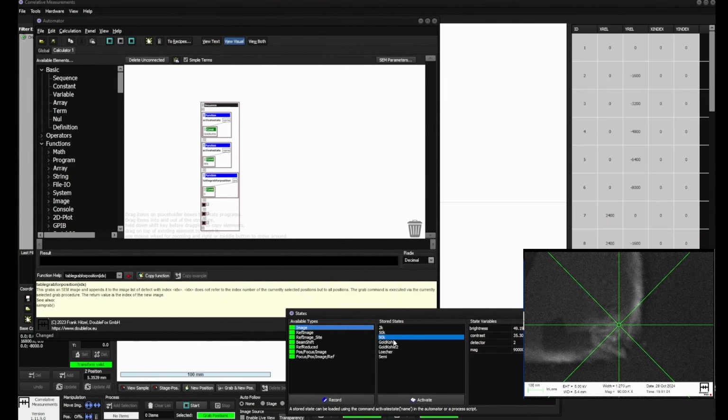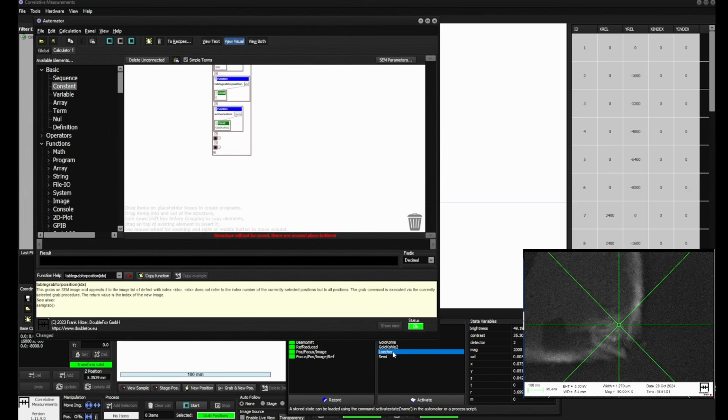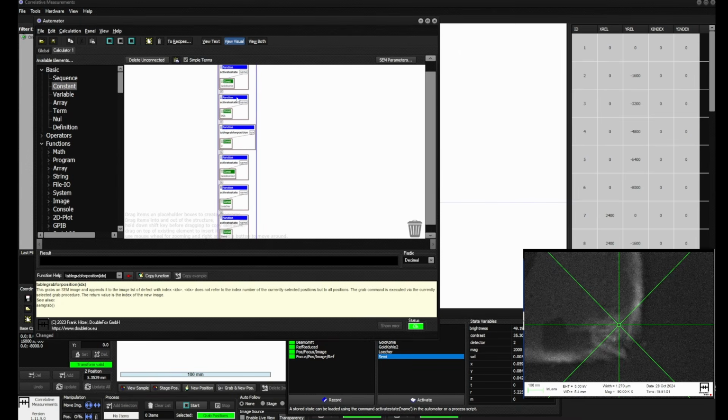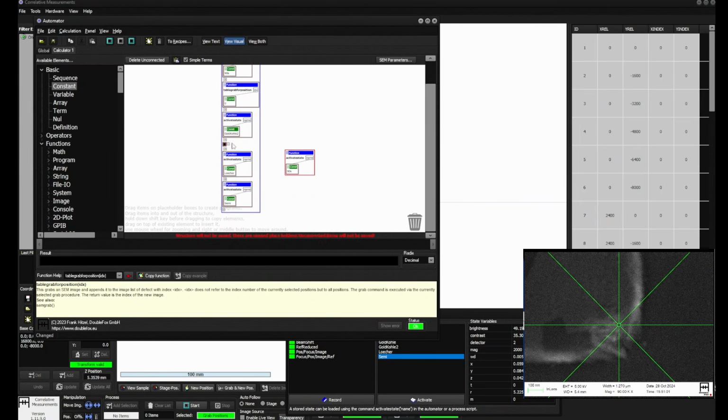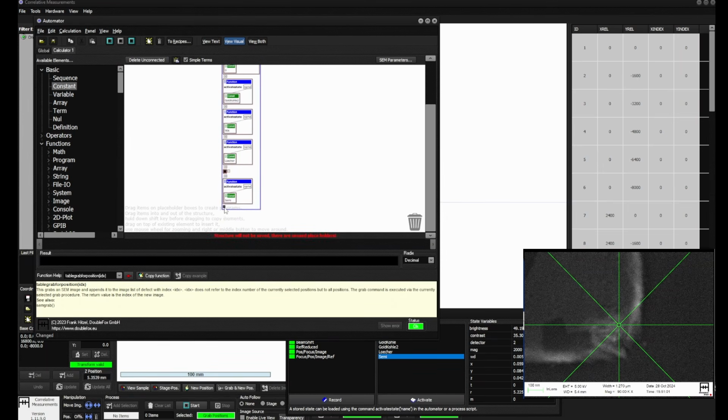Now, well, how should we do it? We can just put this here. That's the second one. Then we have the third one, and then we have the last one. And after that, we want to switch to the 90K stage. We can just copy this here. So we want to put it here, there, and there. So like this and like this.